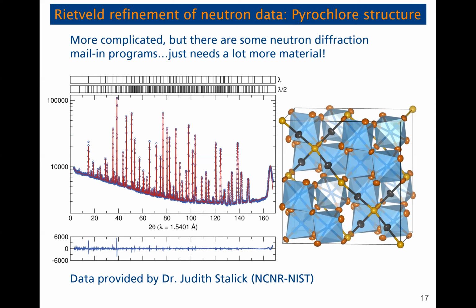You're dealing with entirely different generation means. So yeah, in the first instance, they're a lot bigger. Exactly. Like Becca was saying with respect to how the X-rays are generated, at a synchrotron, you're accelerating electrons around a ring. And basically, the amount of electrons that you accelerate around is going to give you the amount of X-rays that you end up generating, because just by bending them through a magnet, you get to generate some photons.